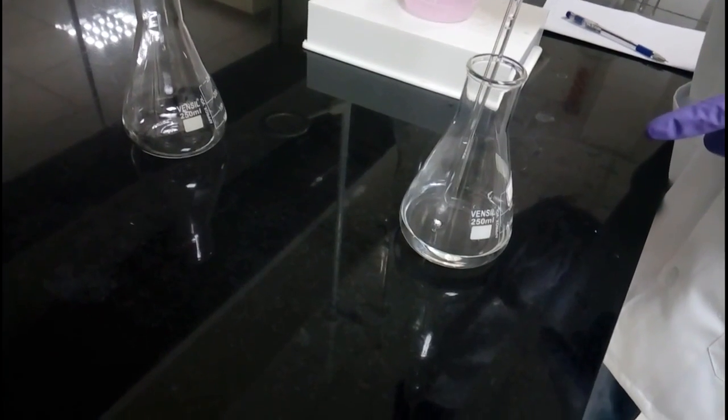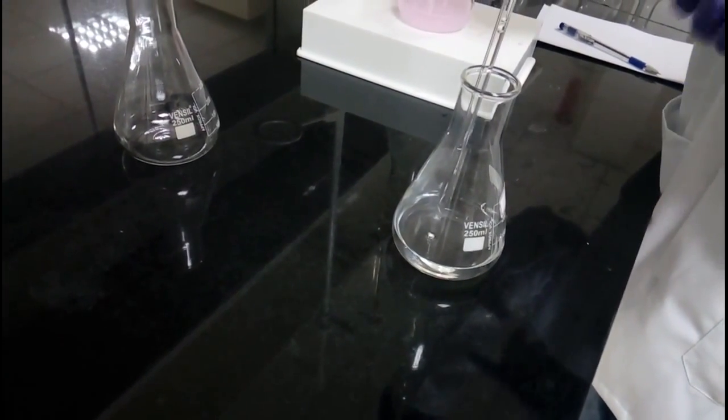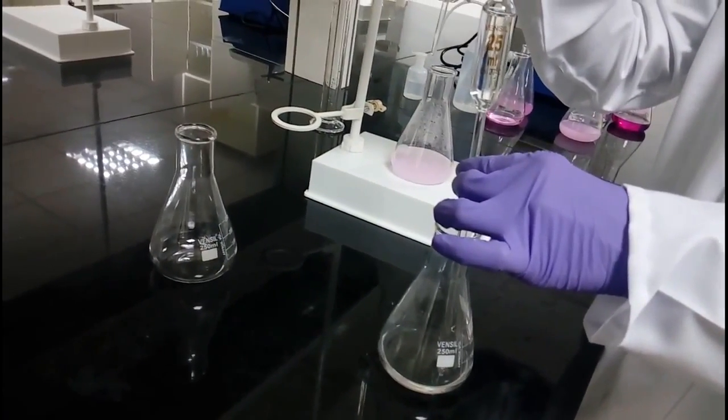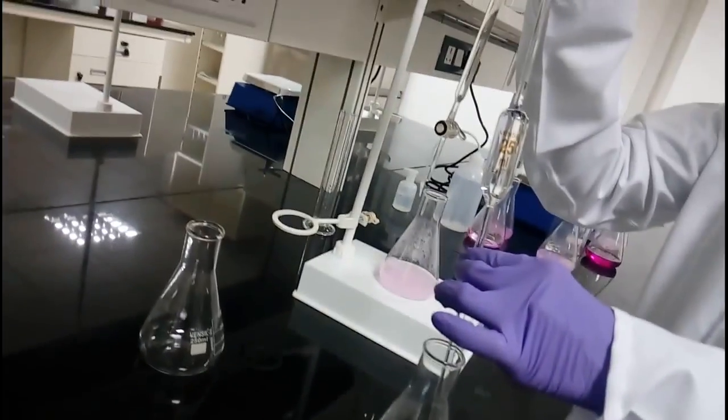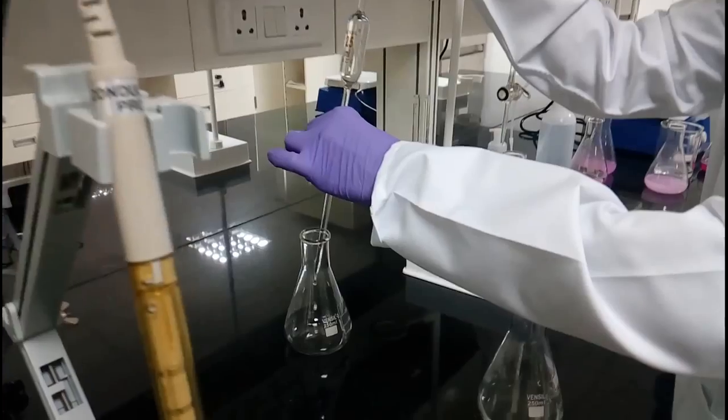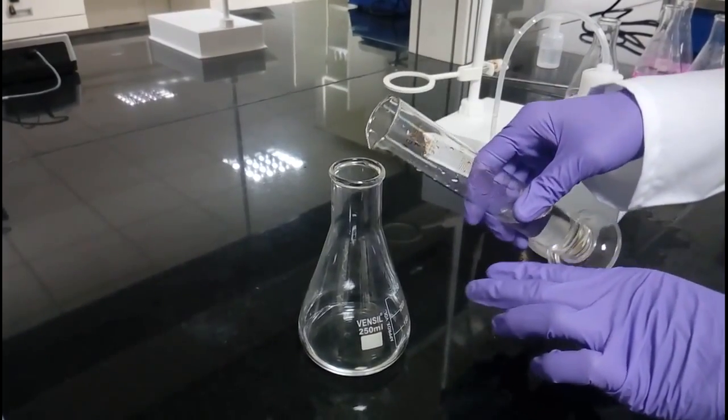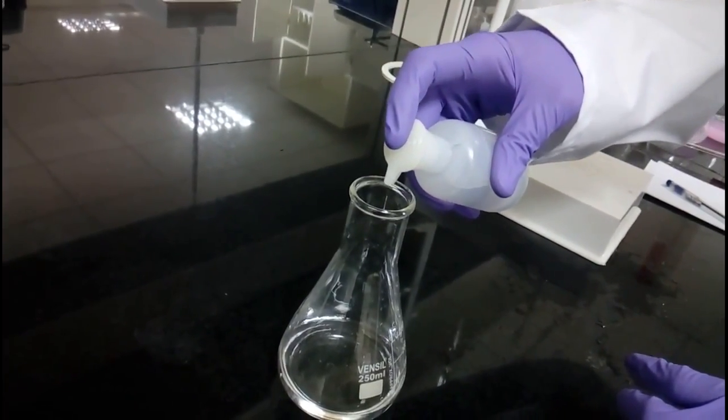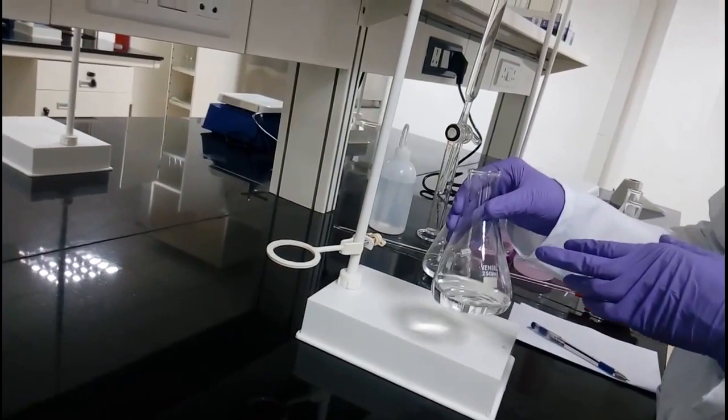We will titrate hydrochloric acid without tablet as a blank. Add 25 ml of 0.1 normal HCl into a 250 ml conical flask. Add 50 ml of water to the conical flask, add phenolphthalein indicator, and titrate with 0.1 normal NaOH.